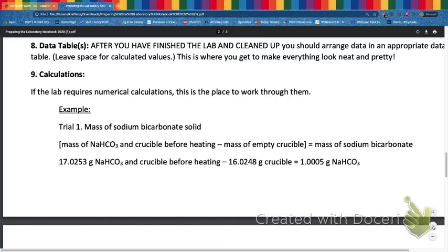So you might want to say, for red dye, 2% isopropanol solution, RF factor, okay, or RF. So you want to identify what it is that you are calculating. And so underneath where your data tables are, you want to make a heading, calculations, and then you want to identify what the calculation is.